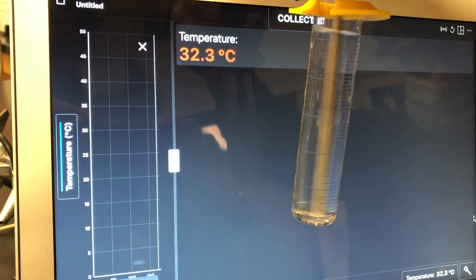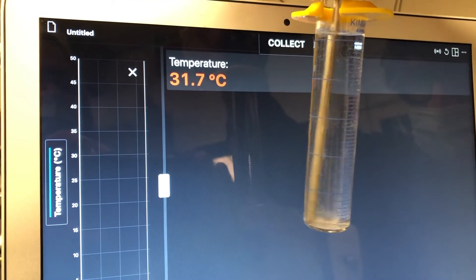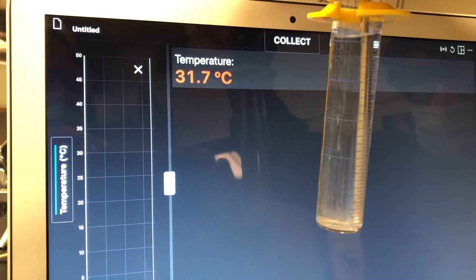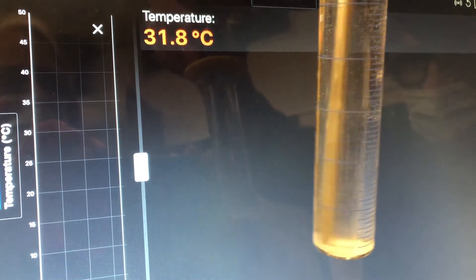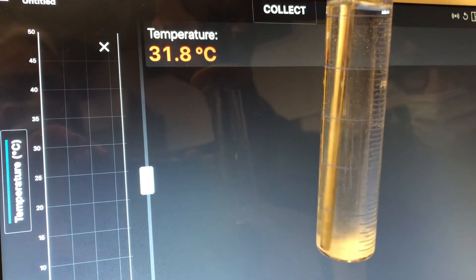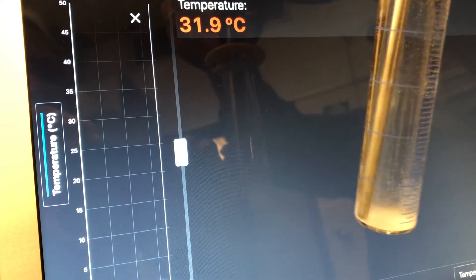A little bit has been edited out to make this less painfully slow. We'll go past the point at which crystals start to form to be sure we've gone far enough. All right — we're going to say that we've definitely had crystal formation.